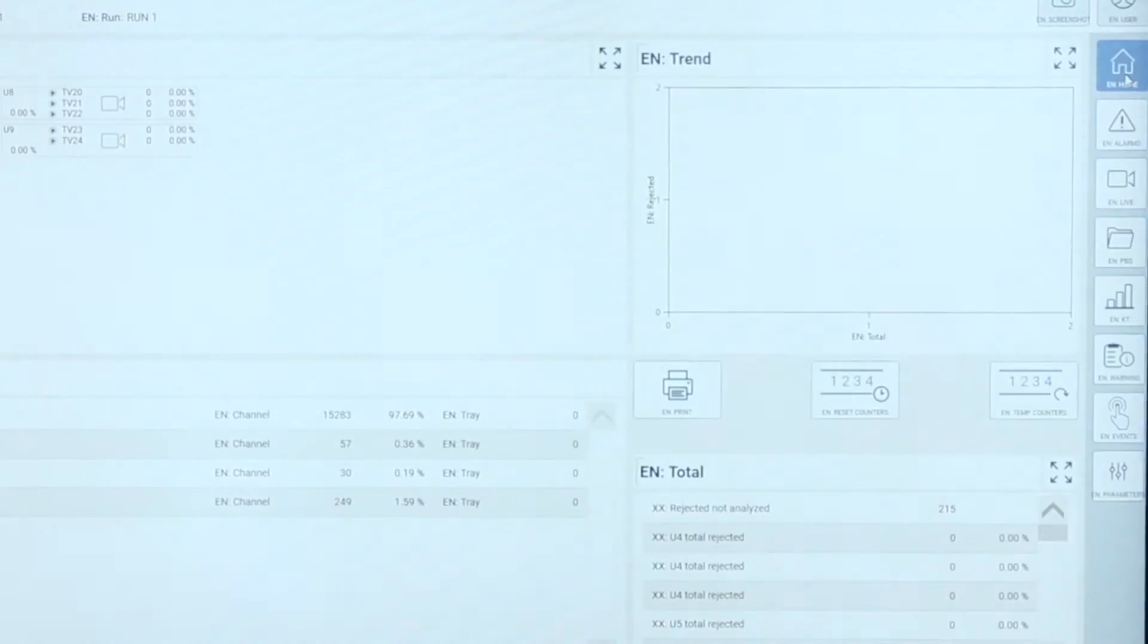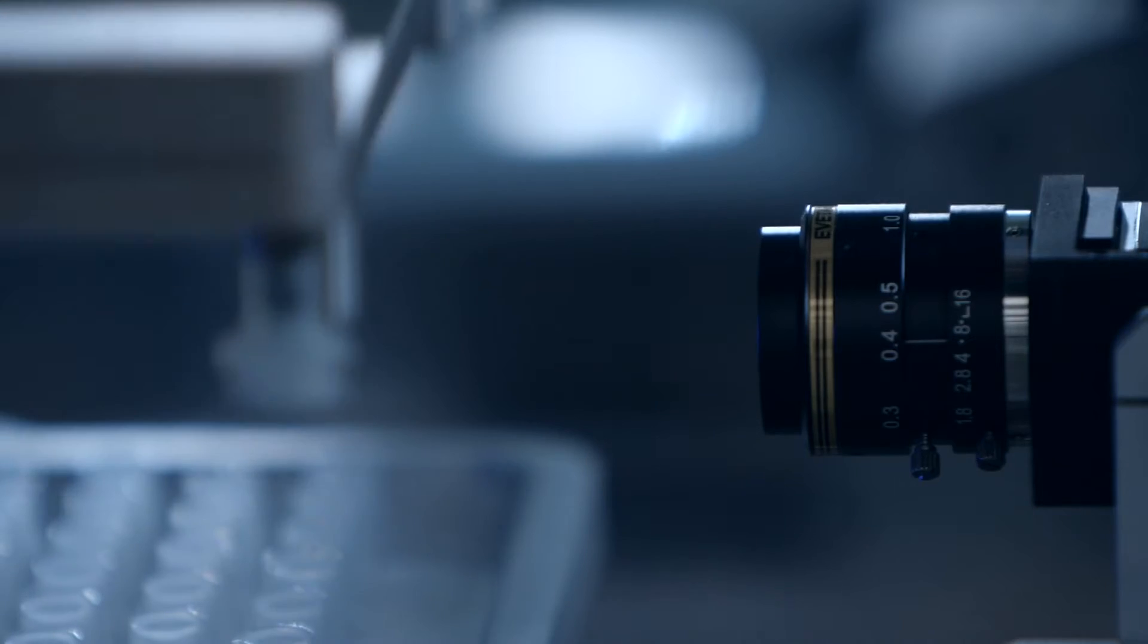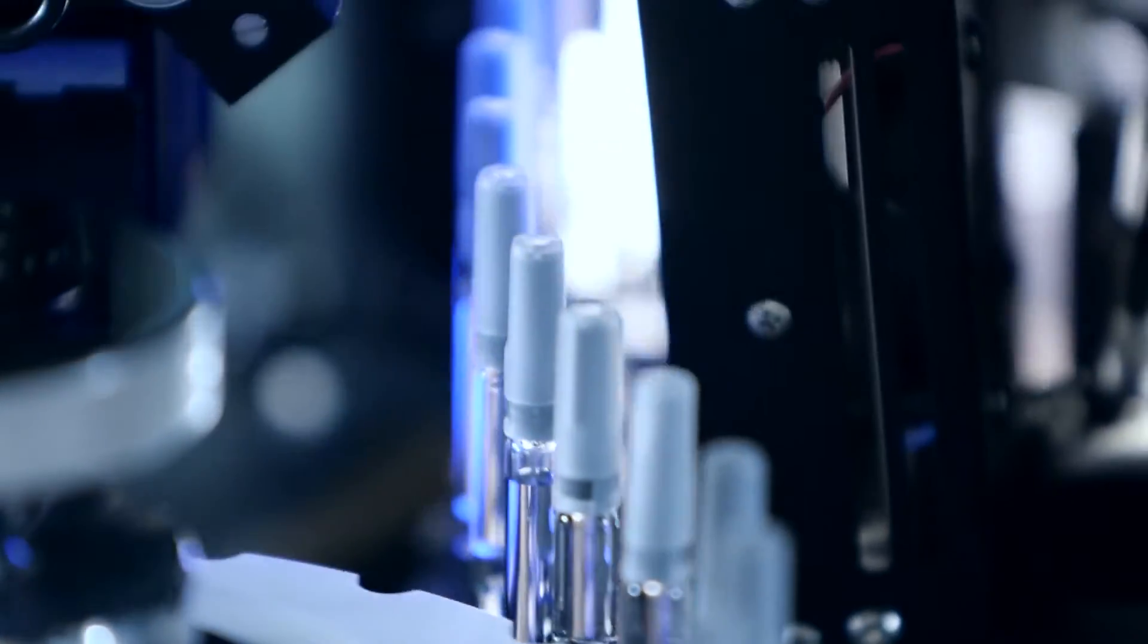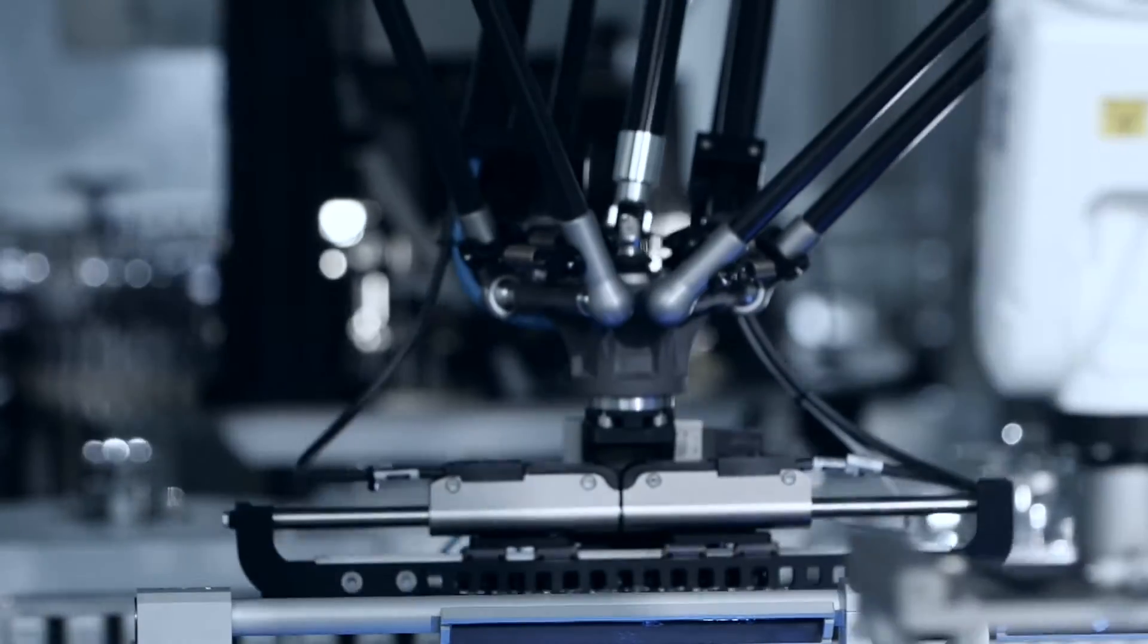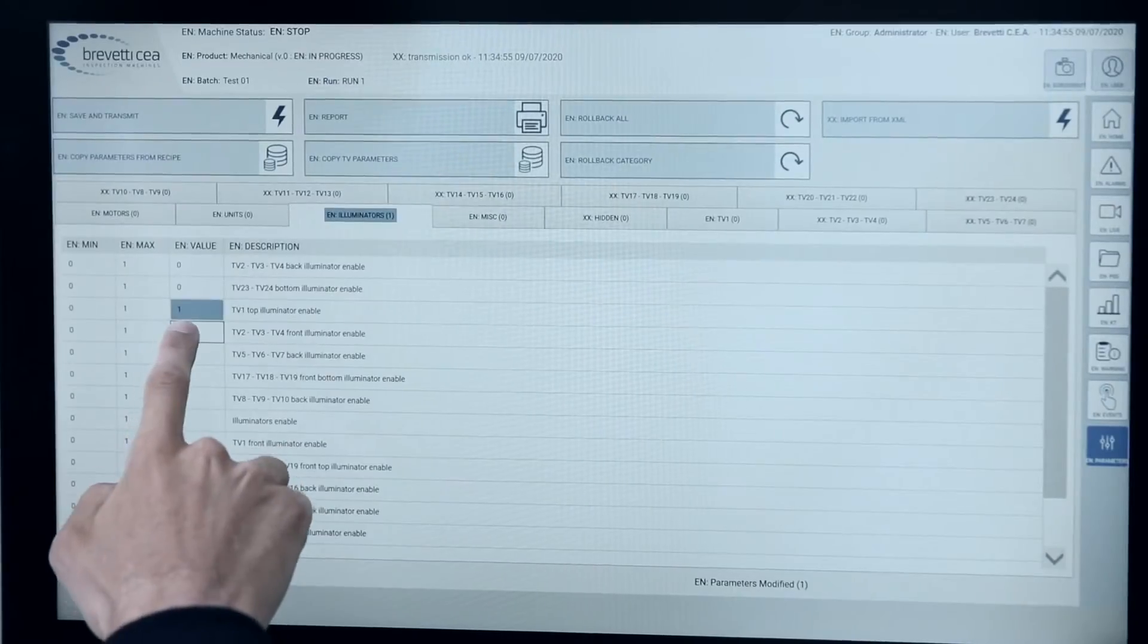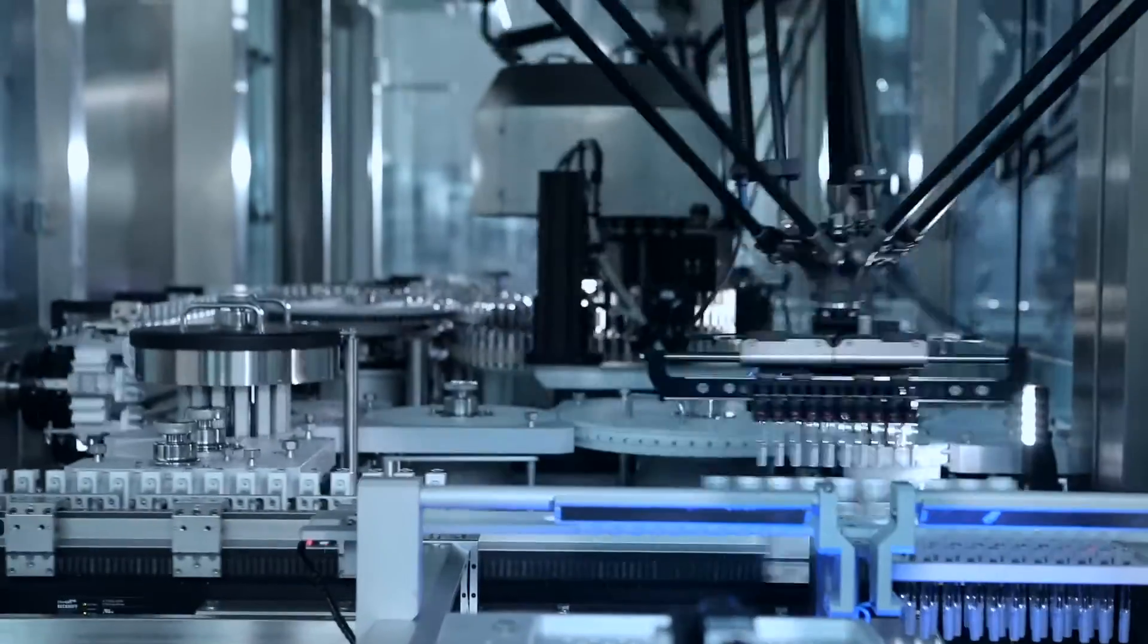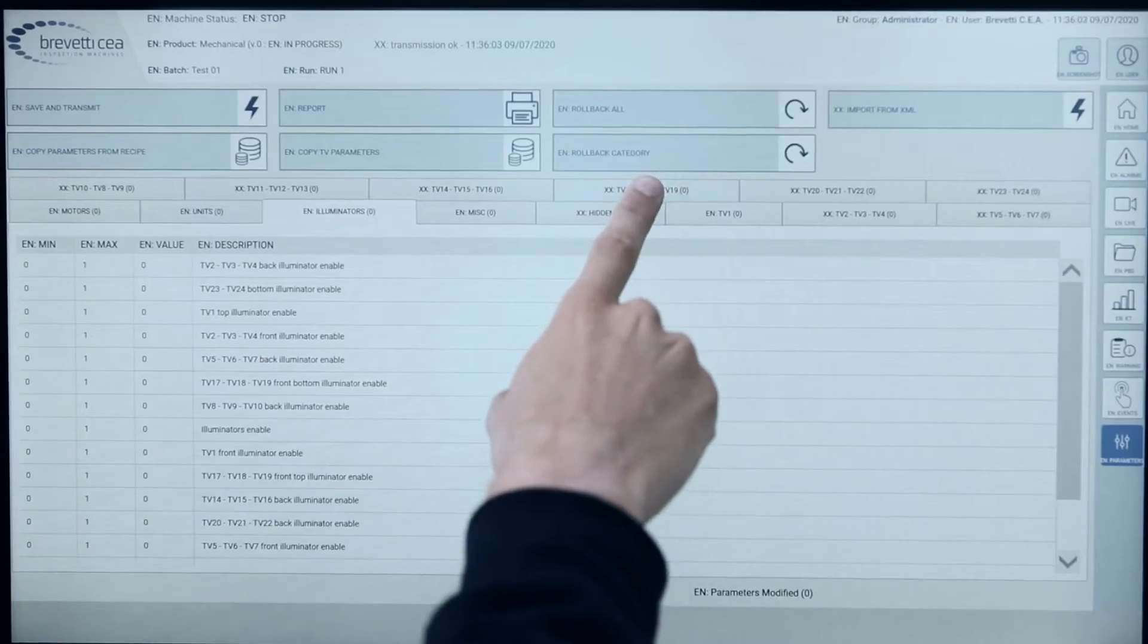The new Breveti HMI release assures real-time live view of the inspection process, a user-friendly guided parametrization tool, as well as the innovative capability of storing images of rejected containers to allow process and quality investigation. An innovative feature for remote parameterization and validation is also available for offline product tuning and operators training, preventing machine downtime.